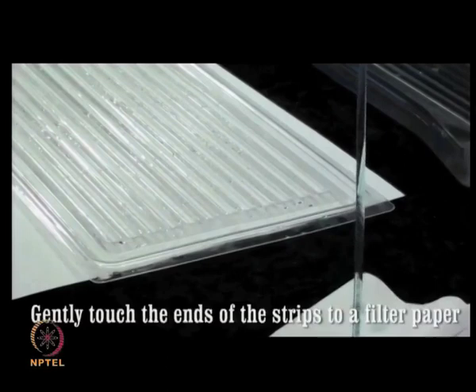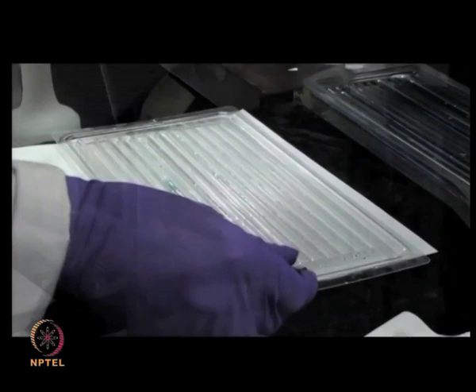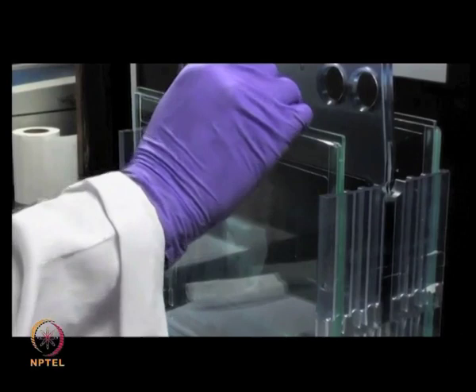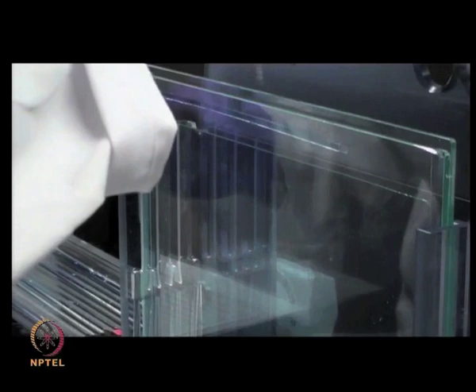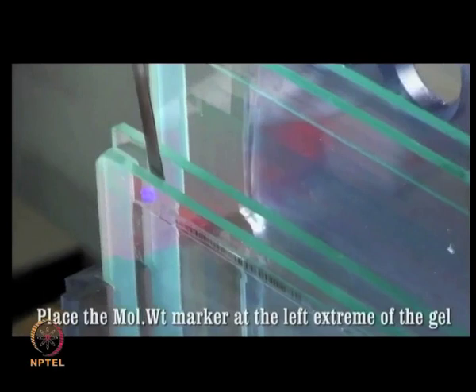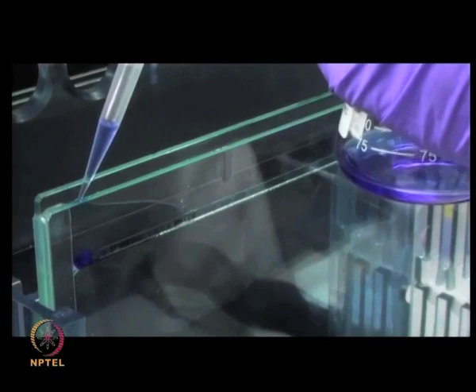Drain out the excess liquid of the second equilibration solution from the IPG strip using a tissue paper. Soak the strip for a few minutes in the same buffer solution that is to be used in the gel tank. Then carefully place the strip in between the glass plates and gently push it in until it rests firmly on the gel surface without any gaps. Place the filter paper containing the molecular weight marker beyond the positive end of the strip. Then pour the lukewarm agarose overlay solution over the strip to prevent the gel from drying up.